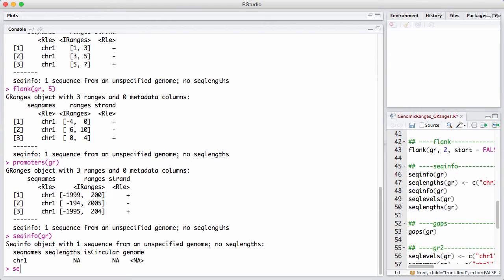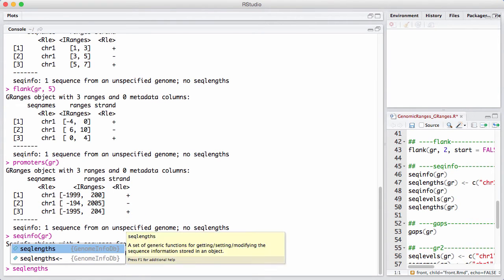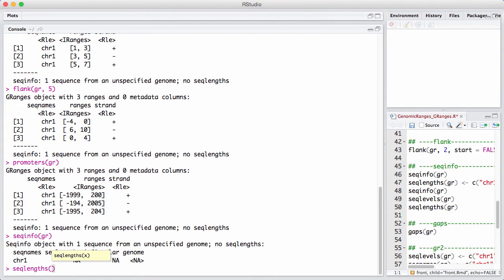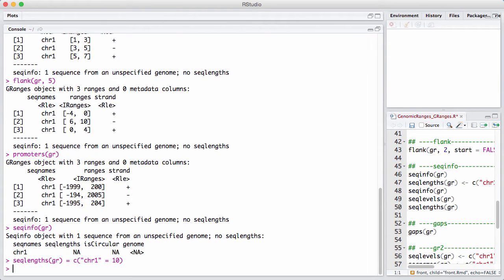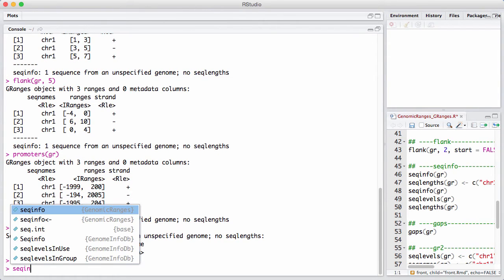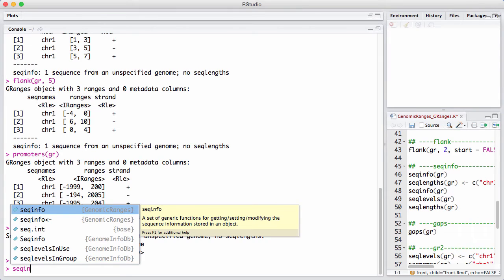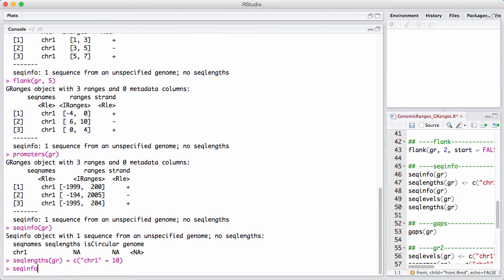So we can, for example, give it a length, which is quite useful. So we're going to say chromosome 1 has a length of 10. And let's see it got recorded there.